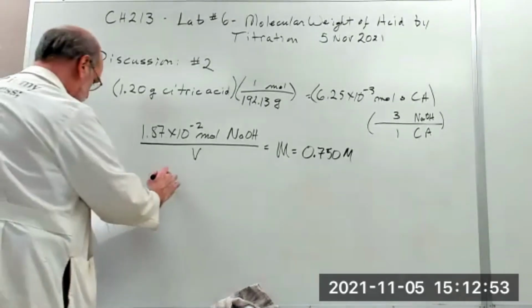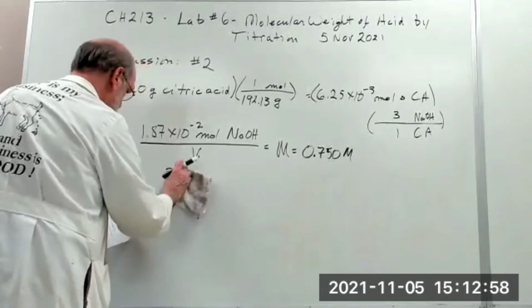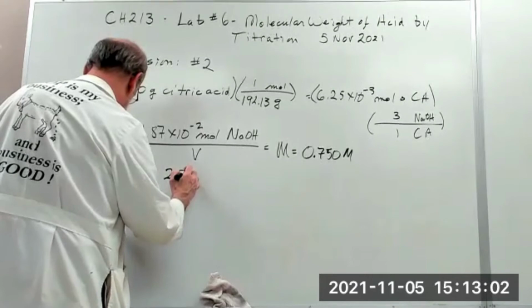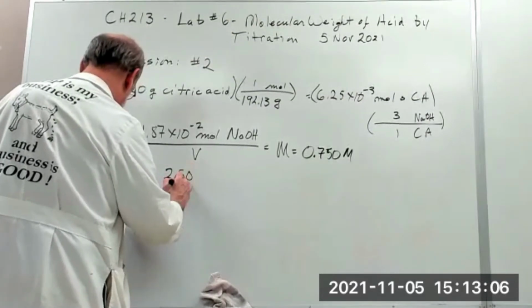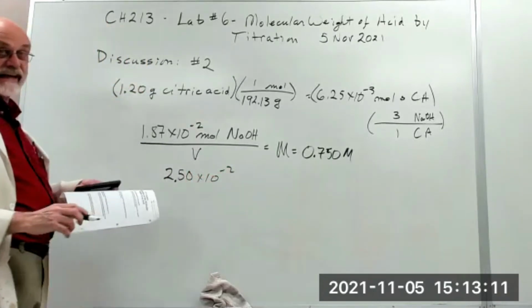So that's 250, 2.50 times 10 to the minus 2 liters.